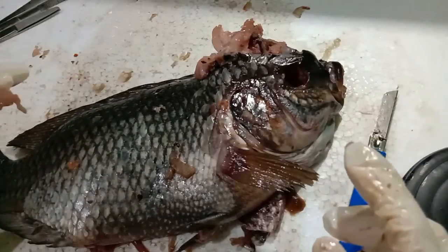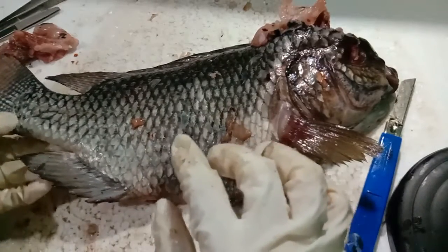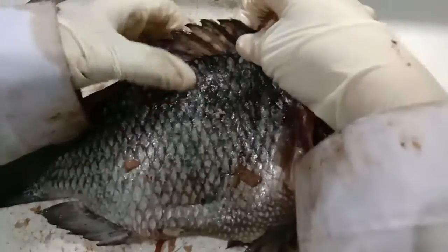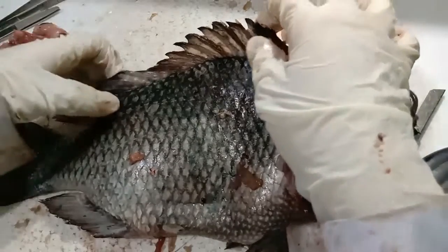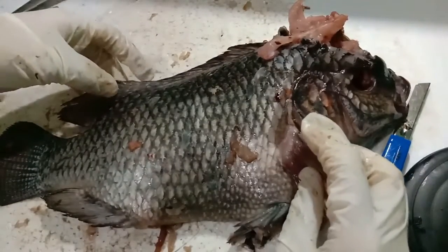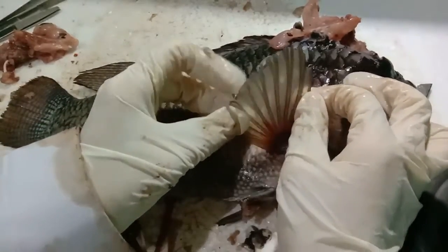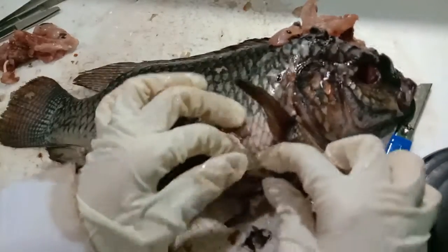And at the bottom of the head, there are the pelvic fin ray and pectoral fin ray. On the trunk, there is a ray of the anterior dorsal fin and a ray of the posterior dorsal fin on the top of the trunk. It's here, anterior, and the posterior. This is the pectoral fin ray. You can see the bone here and the pelvic fin ray here.